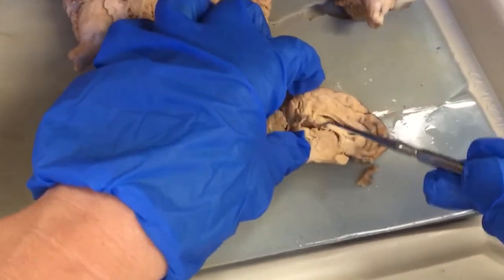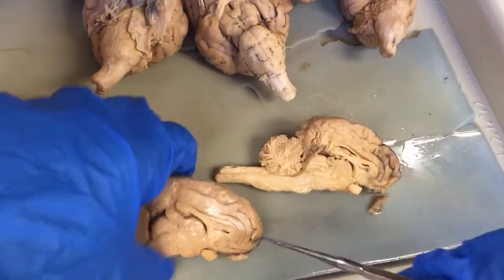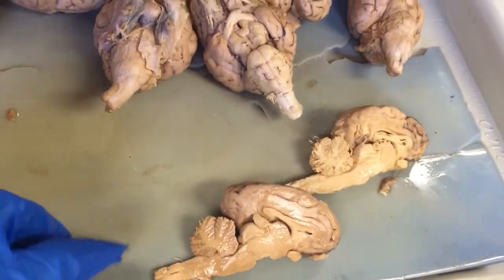I don't know what's going on. Oh, it's just kind of cut weird. Okay, let's use this one.